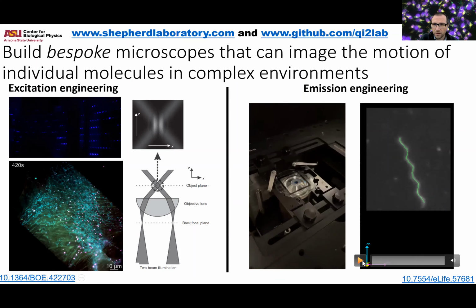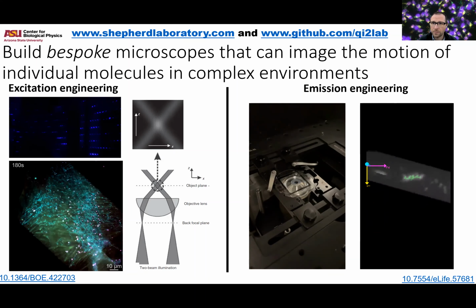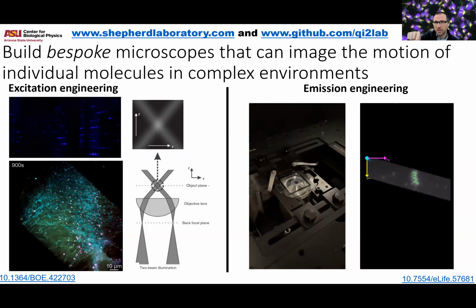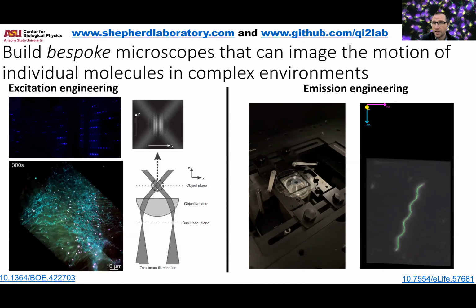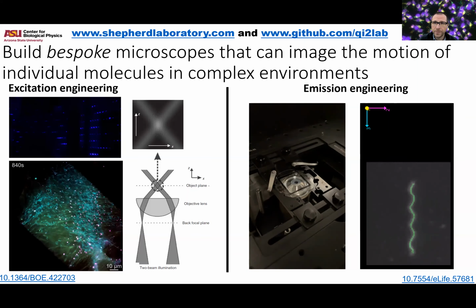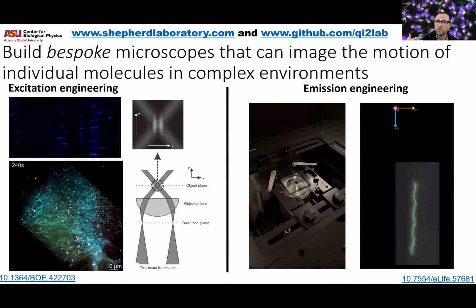So what I have on the right is a flagella. So this is a small filament that's helical in nature. This is prepared by Dr. Rizal Harardi's lab here at Arizona State University, and this works in collaboration with them, where that flagella is actually rotating and tumbling inside solution, and we're imaging at roughly 30 full 3D volumes a second at the hundreds of nanometer scale. And you can see we can actually see this thing rotate and tumble in 3D. So all of this work relies on really understanding the wave nature and the physics nature of light and diffraction and all of these things, and then we build that up into a usable microscope.